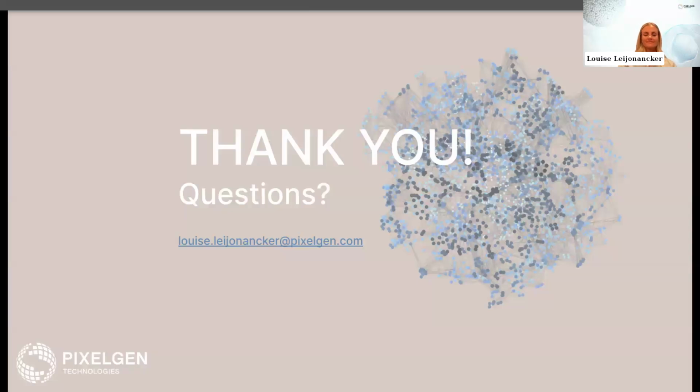And so, as mentioned, we do have some minutes now where we have an opportunity to answer some questions, and I will start with this one here. So, Louise, what level of bioinformatics competency is required to be able to analyze molecular pixelation data? Yeah, that's a good question. So you do need some sort of bioinformatic knowledge and knowing how to get by in ScanPy or Seurat. But there is a lot of material, like I mentioned, out there with tutorials to help guide. And we also have our support team to help out with everything.